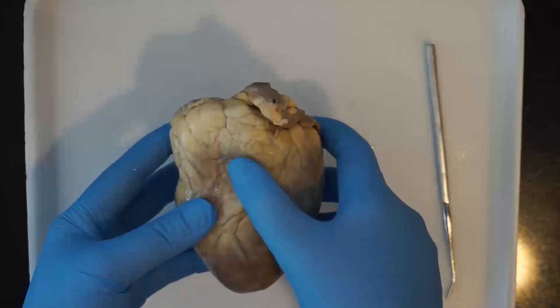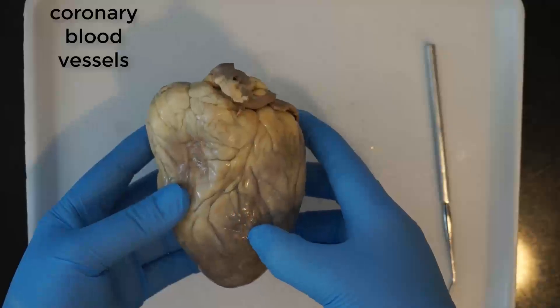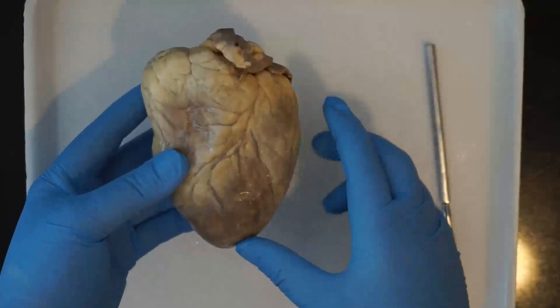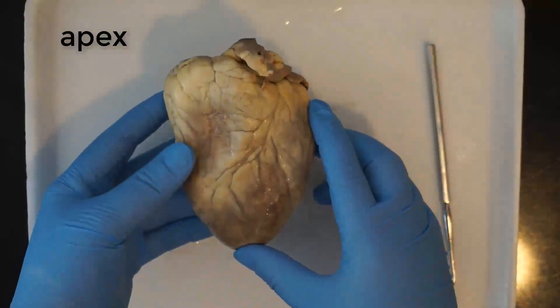Coming off of that interventricular sulcus you have coronary blood vessels, which supply oxygen to the heart itself. It's wrapped with coronary blood vessels all around it. The apex is the tip of the heart at the very bottom.